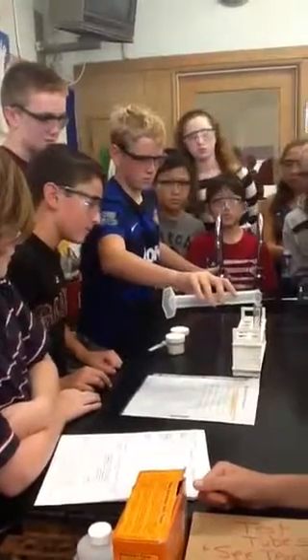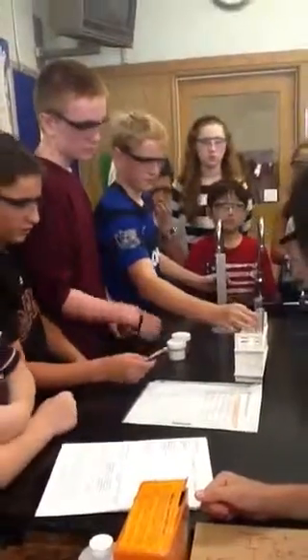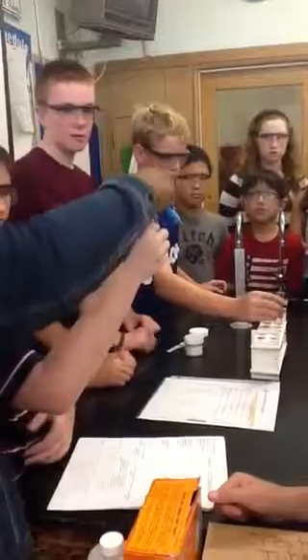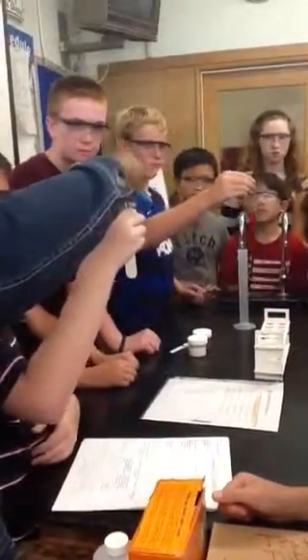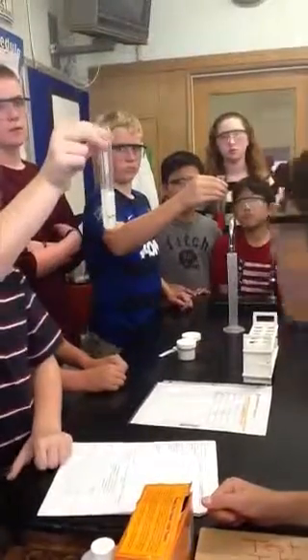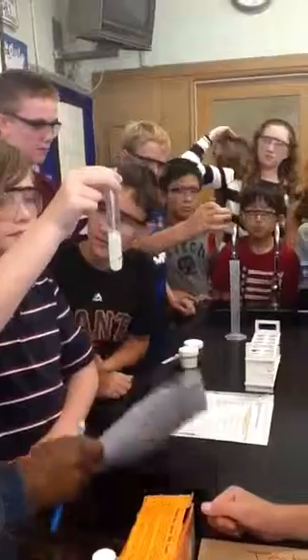Okay, so for them to see it, you're going to have to hold it up. So one person hold up the red at the top. Make sure your hand's not near the base. Hold it up higher so your hand's not in the way. And kind of rotate it so you can see it. All right, who wants to talk about what happened when your substance was exposed to water?